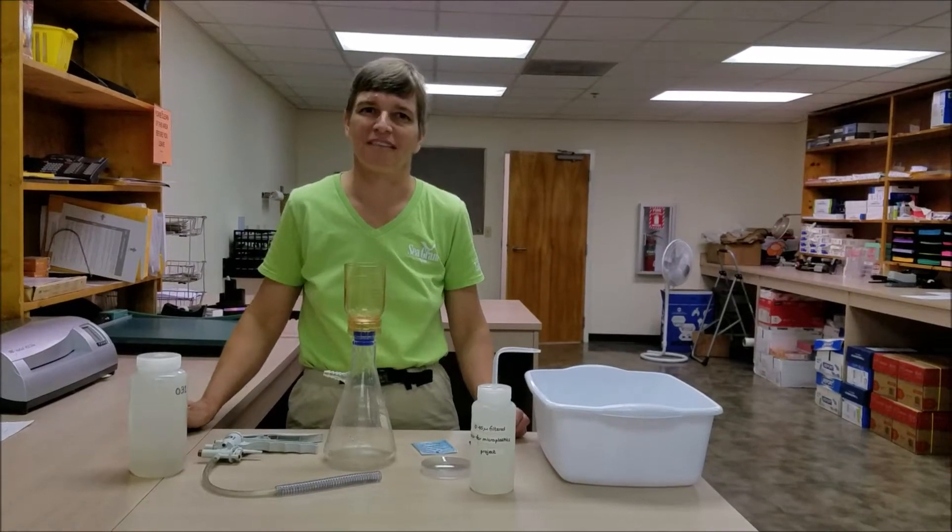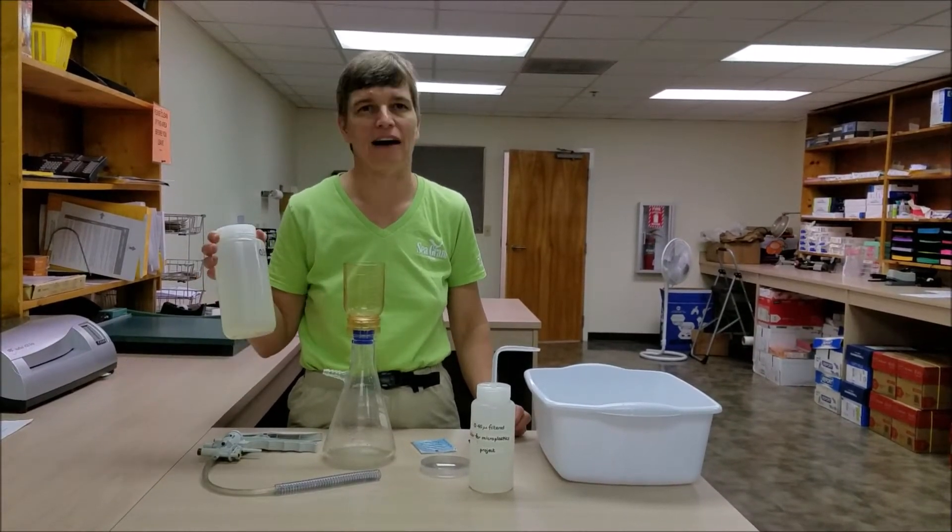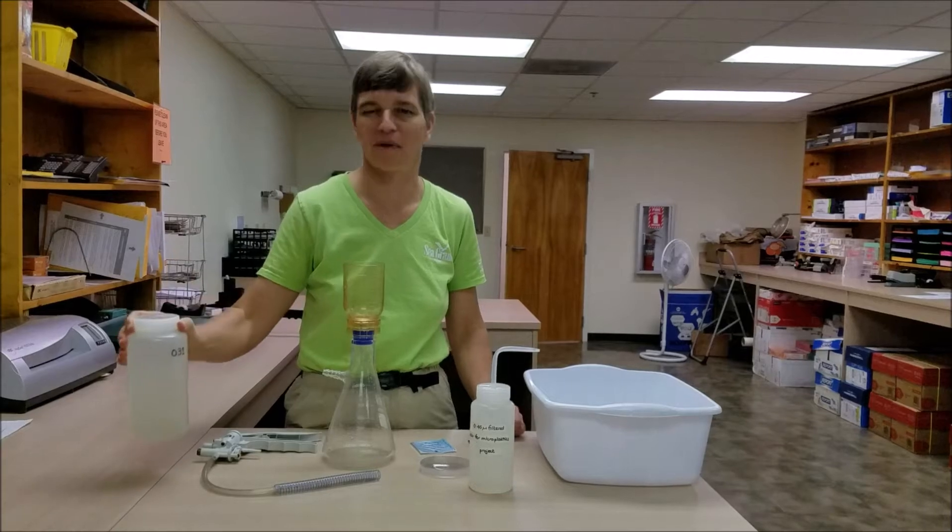This video will walk us through the process of filtering an actual water sample for the Florida Microplastic Awareness Project.